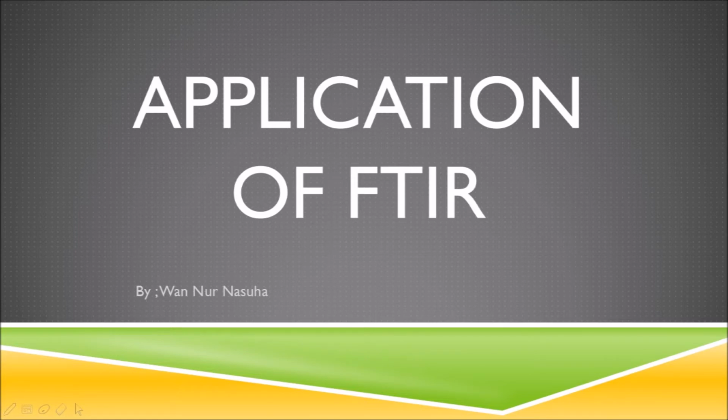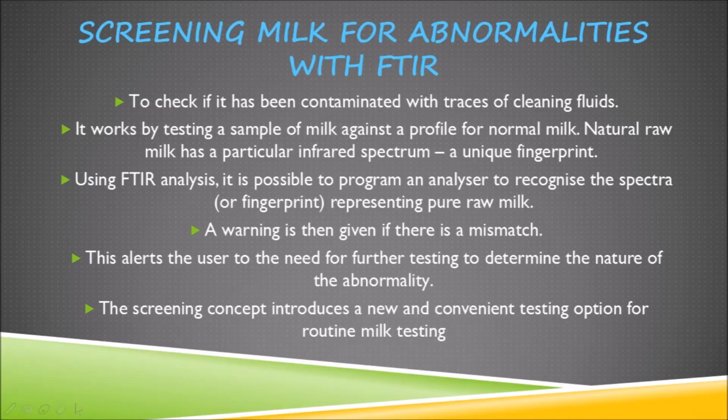Okay, so hi. Now we are going to talk about the applications of FTIR. FTIR is usually used in several things. For example, screening milk for abnormalities, first, to check if it has been contaminated with traces of cleaning fluids.